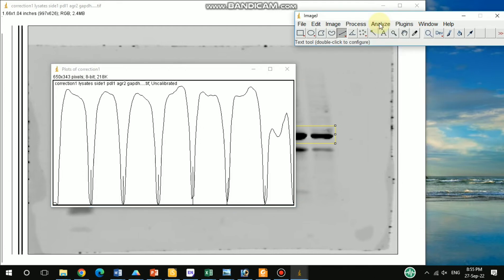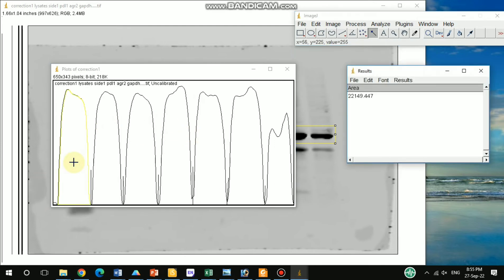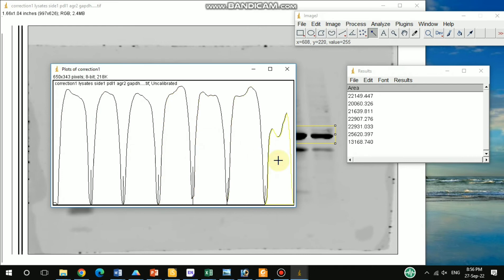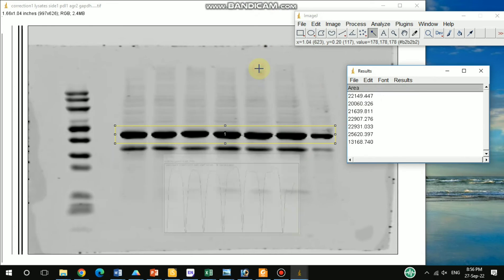Next, find the Wand tool and select it. When you select the wand tool, click inside each peak one by one. When you click, you will see a yellow color indicating that the peak intensity has been calculated. Repeat for each peak one by one, and you will get the intensity values. The area shown represents the intensity.